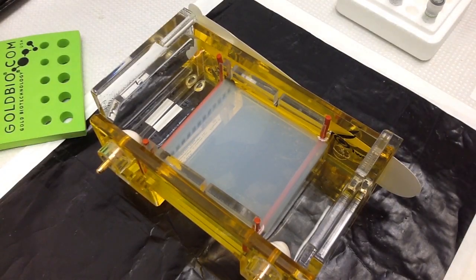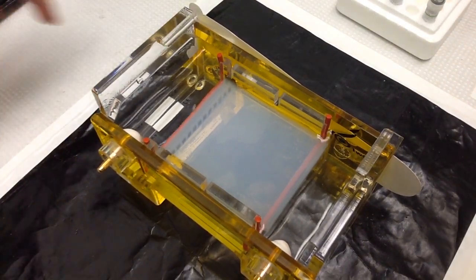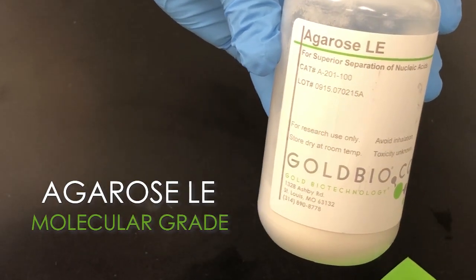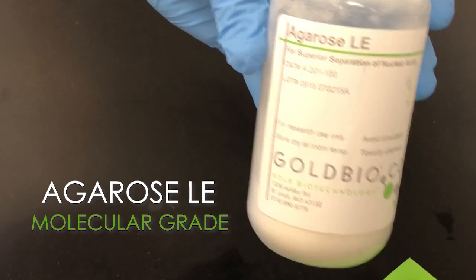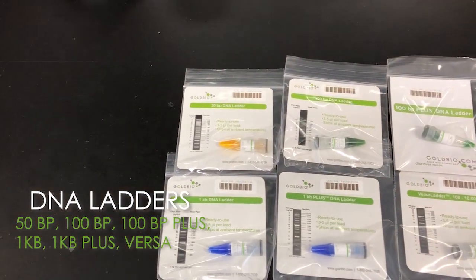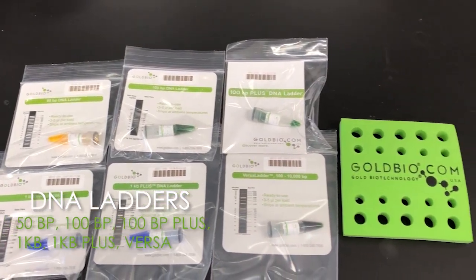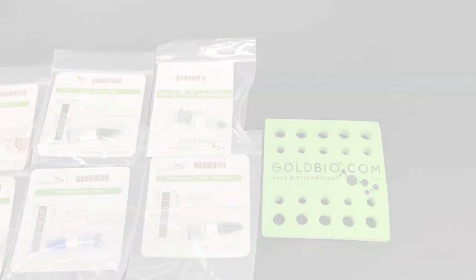Today I'm going to show you how I load a gel using our DNA ladders. I used our agarose LE to make the gels. The great thing about this gel is that it's versatile and can be used to separate nucleic acid but also in protein electrophoresis. Our ladders come ready to use. There's no diluting or loading dye necessary.